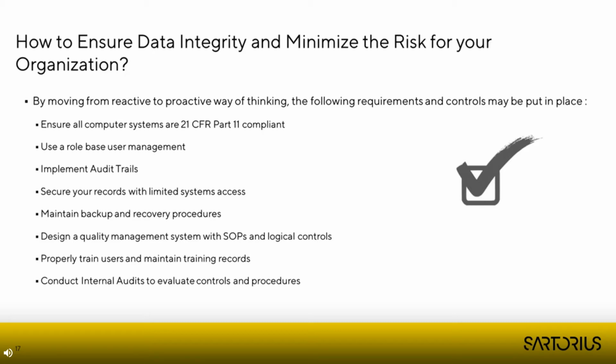And it is therefore always important to identify the GxP relevant processes, data, and systems, and to do a risk assessment based on this. Then you should create SOPs and train your users on the SOPs and on proper data handling. Also, regular audits should be performed and the qualified condition of the system should be ensured. Altogether, an open quality culture can prevent problems through data integrity violations.